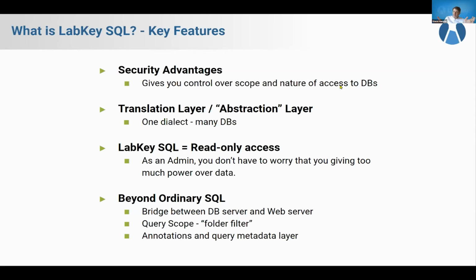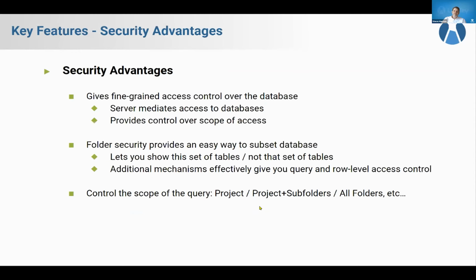Also, it's important to remember that LabKey SQL is really quite limited in that it's read-only. You can't update data with LabKey SQL. You can't insert data with LabKey SQL. It is explicitly about querying data, interrogating data, asking questions about the data, and getting back the data. You can't update or change the data with LabKey SQL, and that's a good thing. As an admin, you don't have to worry about what you're doing when you give somebody access to LabKey SQL. And then there are other features that go beyond ordinary SQL, and we'll get into those when we get there. Just a little bit more on the security advantages.